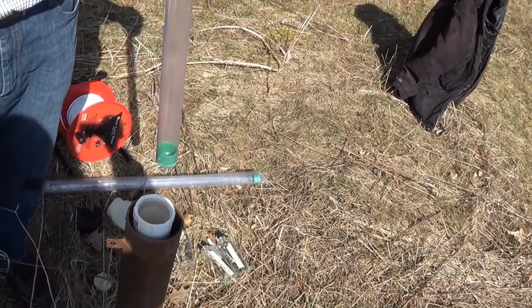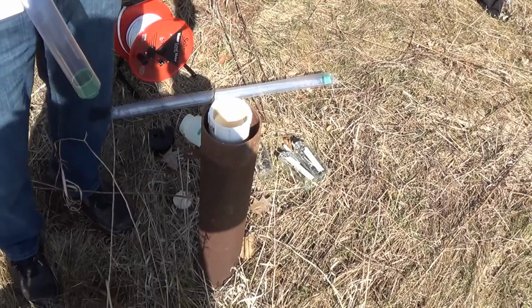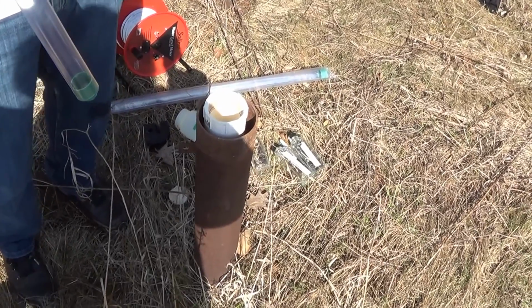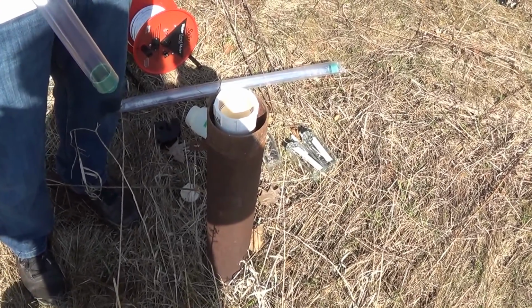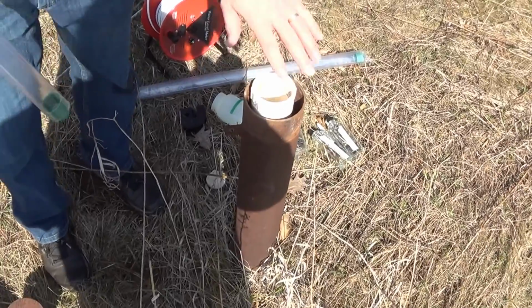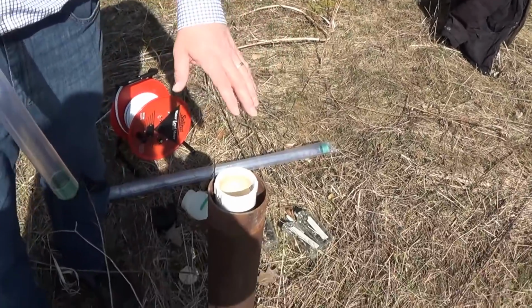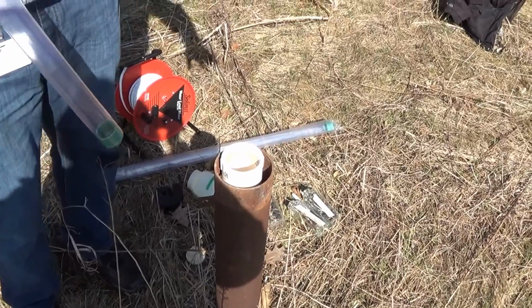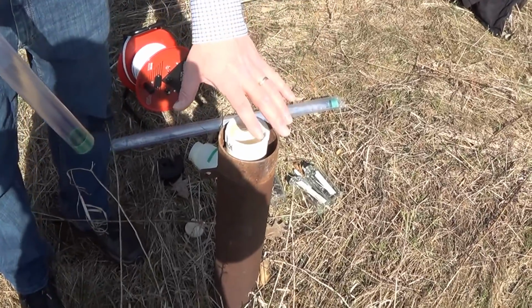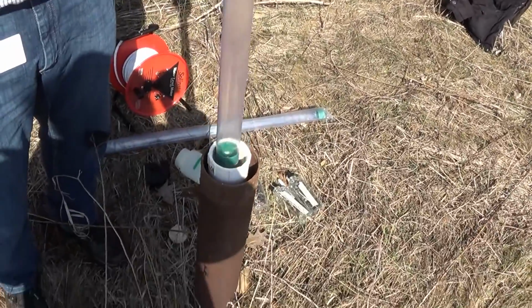What we would also do, if this were a hazardous waste site, is recover anything coming out of this. Even the water that we would bail would be recovered in 5-gallon drums or larger containers for disposal. We wouldn't be able to put it here. Of course, I know this is not a hazardous waste site, so I'm going to dispose of our baling water just out here on the grass. But it would be important to recover that water, because if you're coming up to a well that you're not familiar with, you don't know what's in that well, and you don't want to be introducing those contaminants onto the surface. So I'll just show you this.